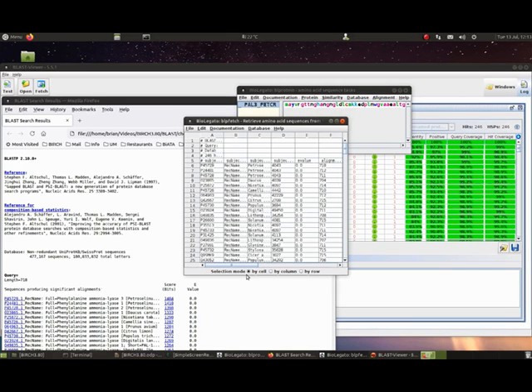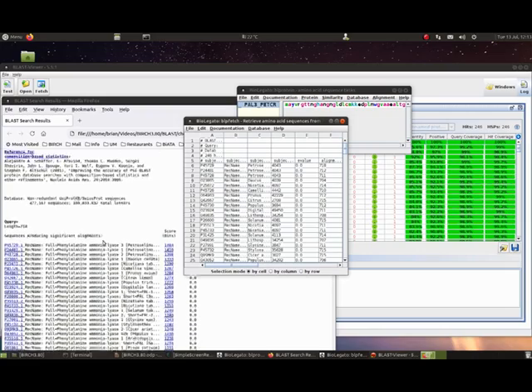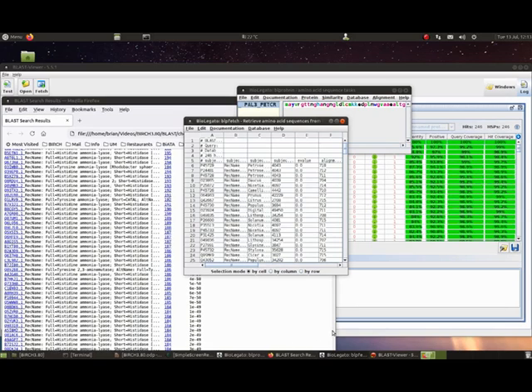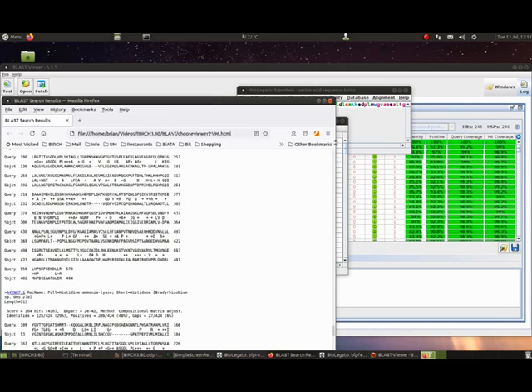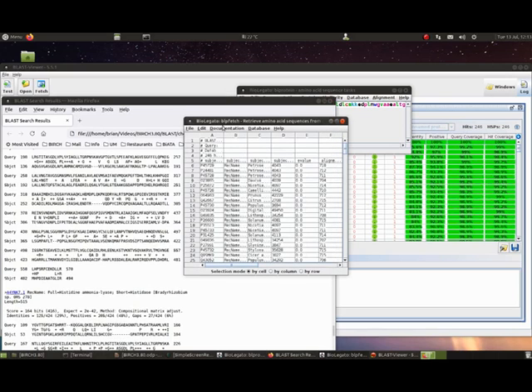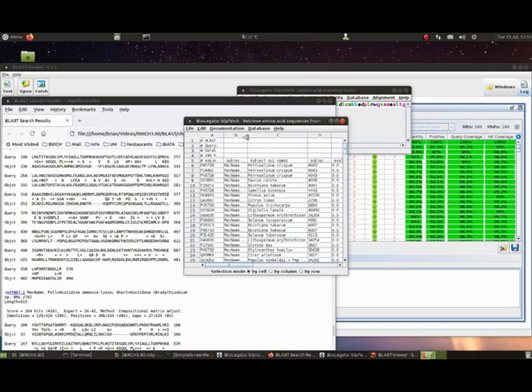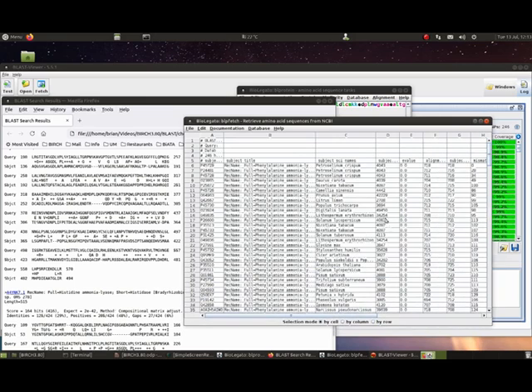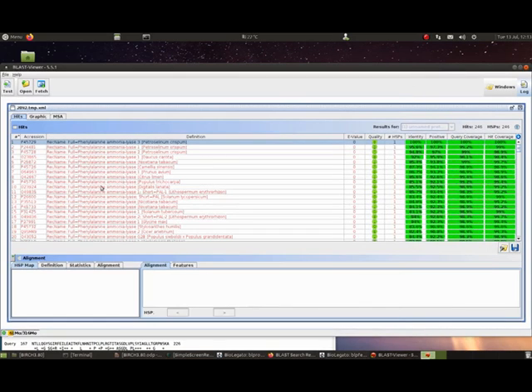As you can see, we get results in a number of forms. We get the traditional HTML results that show you the alignments and the names of the hits. And then we get much of the same data in BLP fetch, which has things like the name of the species the sequence comes from, and not surprisingly the parsley sequences are at the top. We'll get back to that in a little bit.